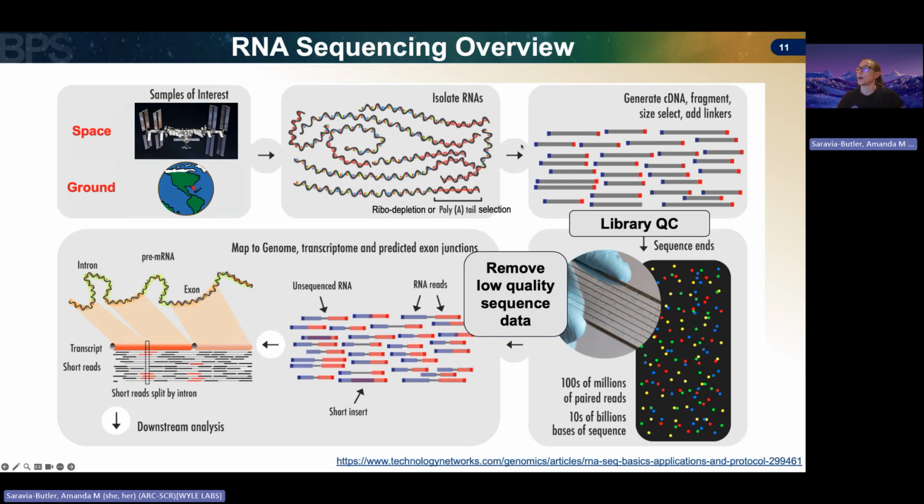After you remove your ribosomal RNA by either mechanism, you're then going to move on to build and construct your sequencing libraries. This consists of adding on your adapters. As a reminder, 3 critical pieces to your adapters. The first flanking your target region is going to be your sequencing primer. The second is going to be your index. Your index, again, is going to let you know which sample each sequence came from. And then that third region is going to be either your P5 or your P7, and that's going to allow you to hybridize to the flow cell to be able to do the sequencing.